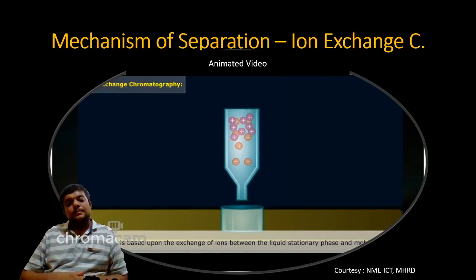The separation is based upon the exchange of ions between the stationary phase and the mobile phase. The stationary phase has exchangeable ions.